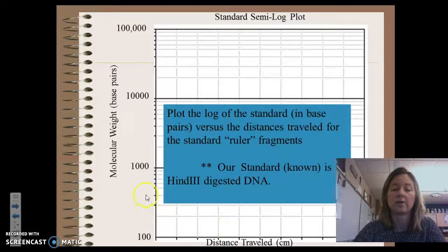Okay. Now, if we take a look at the y-axis, on our data it is already labeled, and you will notice that it's kind of interesting. We're going to start from 100 down here. Our next line will be 200. Then we're going to count by hundreds all the way up: 300, 400, 500, then we have 800, 900, we get to 1,000, and that makes sense.